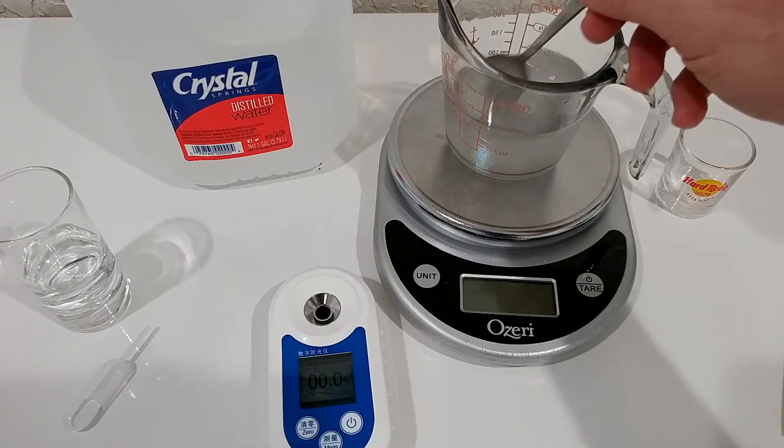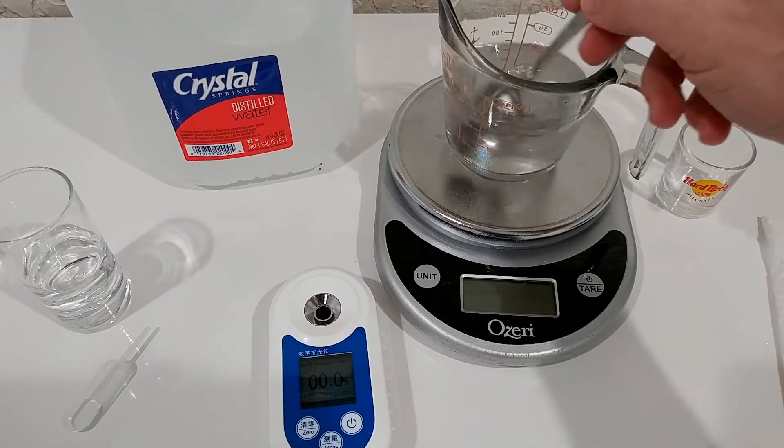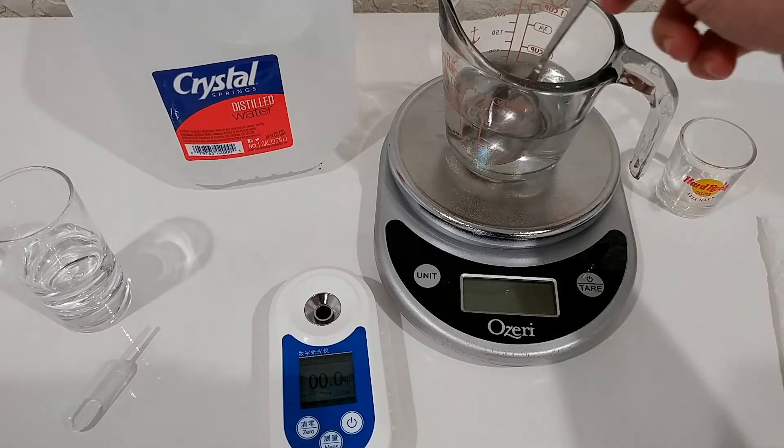At the very end it should be around 10%, or actually a little bit less, because the total amount would be 110 grams and we only have 10 grams of sugar. So that's a little bit less — maybe 9% or so.